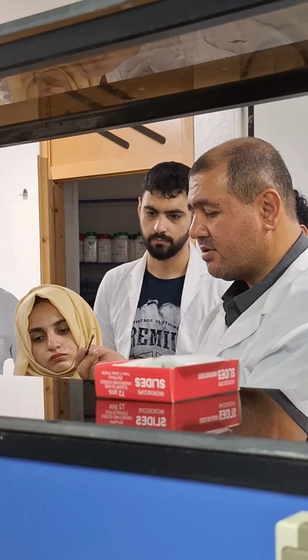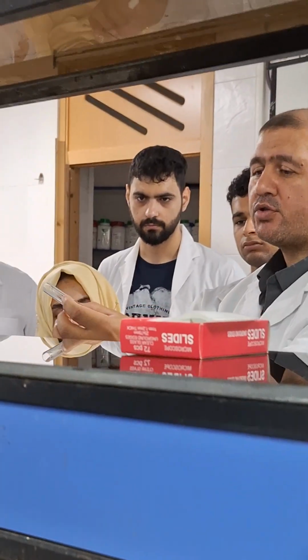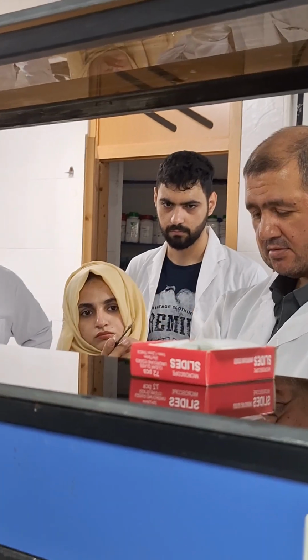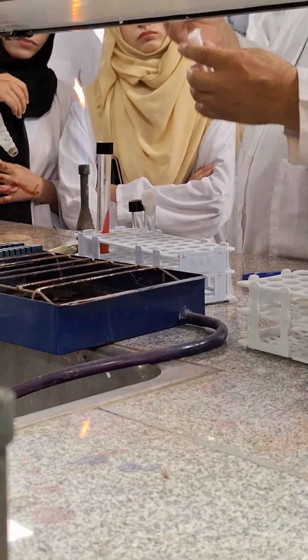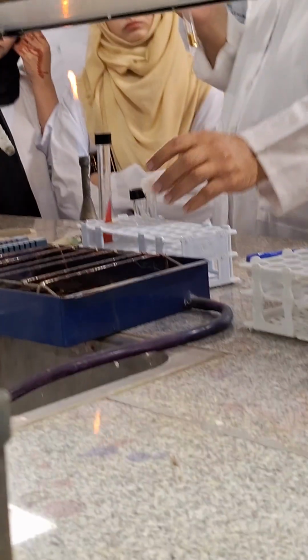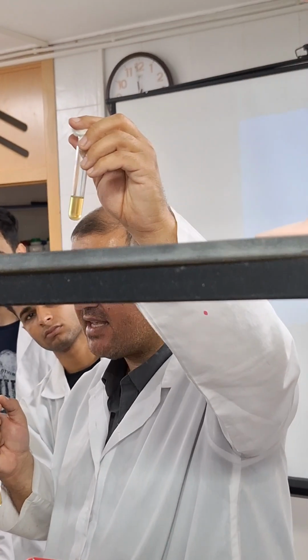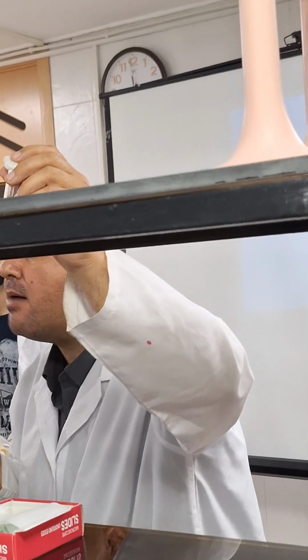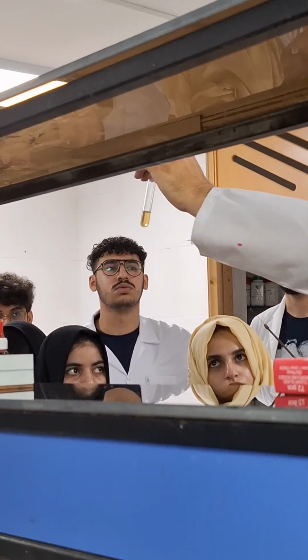Sterilize the neck of the tube. Then, near the flame, tilt your tube. And semi-solid. Look here, this medium is SIM, semi-solid media. M is from motility. We distinguish the motility of microorganisms on this medium, SIM.